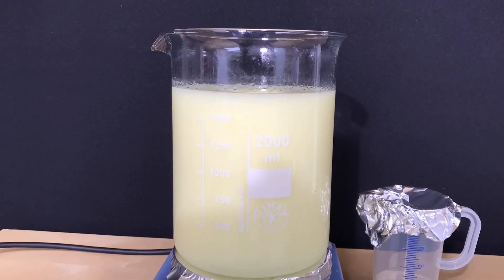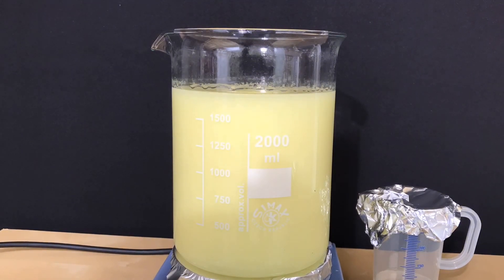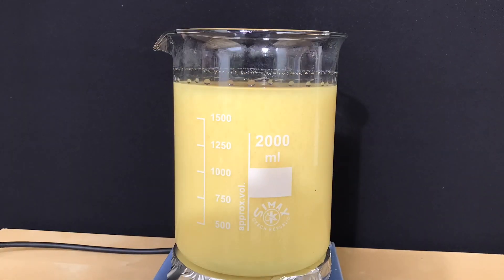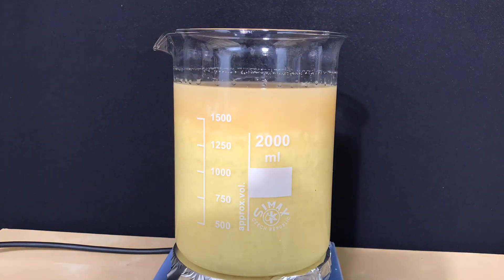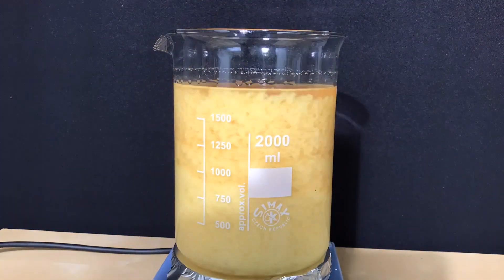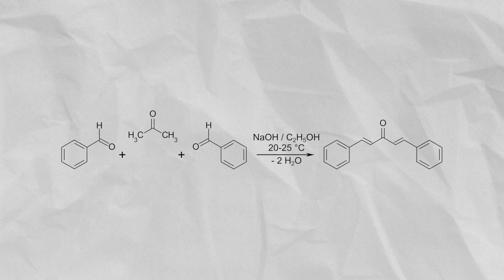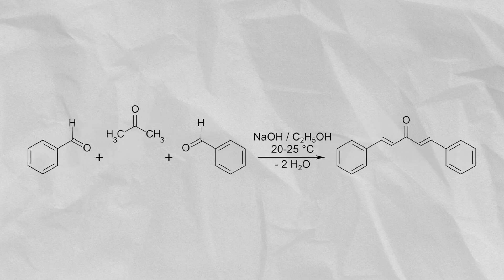After about a minute of stirring, the color rapidly changed to white and later on to yellow, meaning the reaction was working. We stirred for 15 minutes after adding the first batch of the benzaldehyde-acetone mixture, then added the rest and stirred for another 30 minutes. The type of reaction taking place is a base-catalyzed aldol condensation, where two molecules of benzaldehyde react with one molecule of acetone to form one molecule of dibenzalacetone.